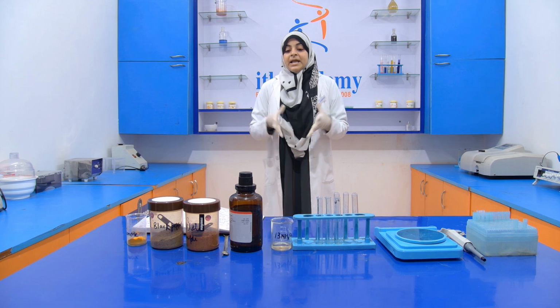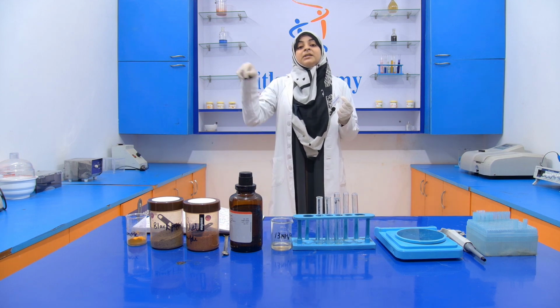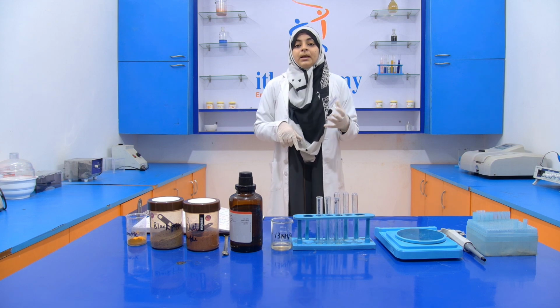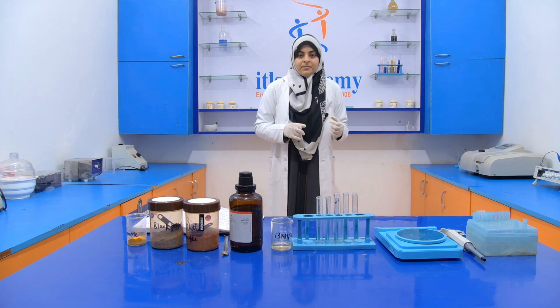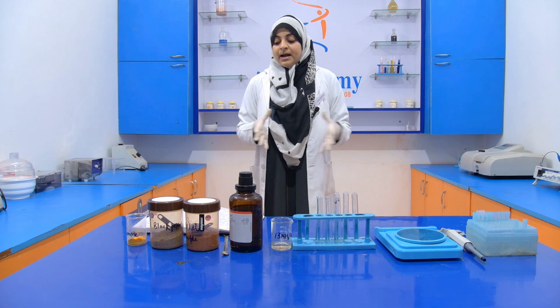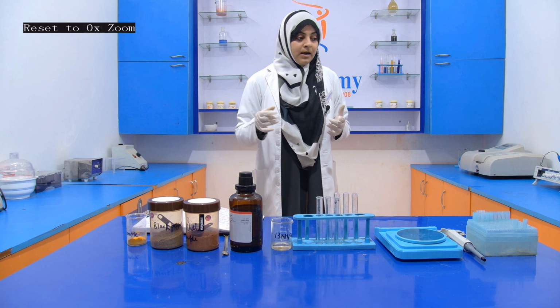After that, in red chili, if a red color appears just above that layer, and in turmeric we get a yellow color, and in black pepper we get a slightly brownish color, then it indicates that our sample is adulterated with added color.